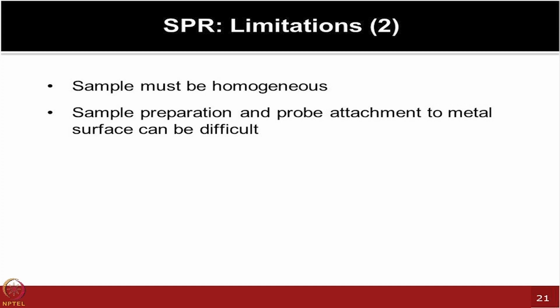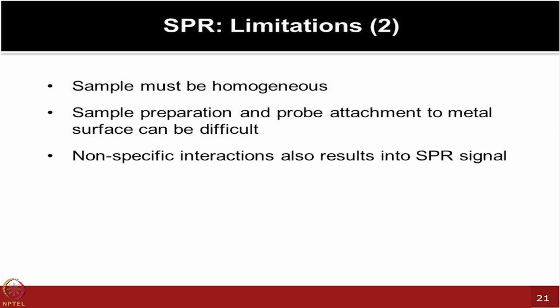So, sample preparation and these probe attachments could be difficult, but I am sure these are some of the generic things which apply to any kind of chip-based assay which you have to follow. You have to ensure that your washing and all kinds of cleanup steps are well performed, otherwise you will have many non-specific interactions.